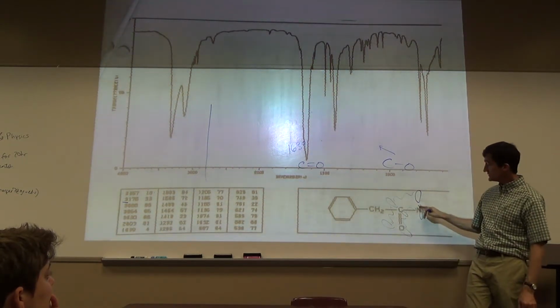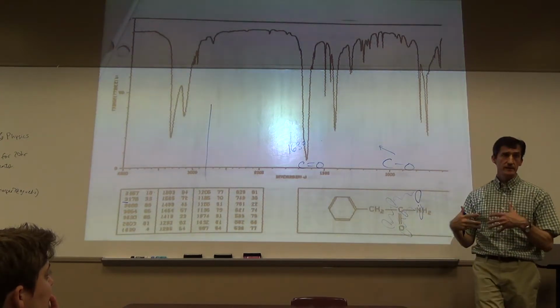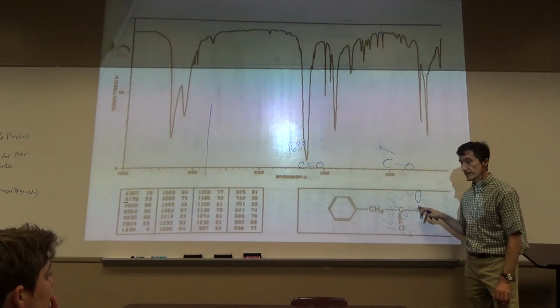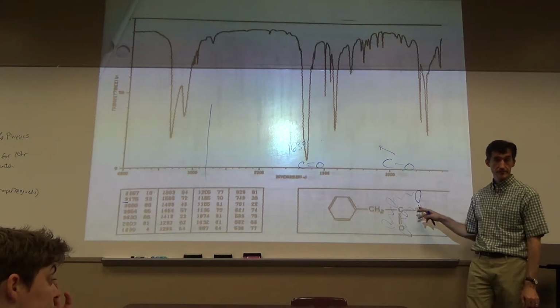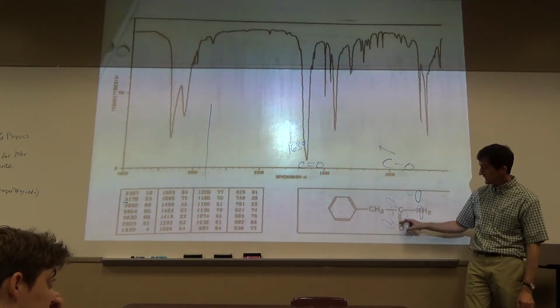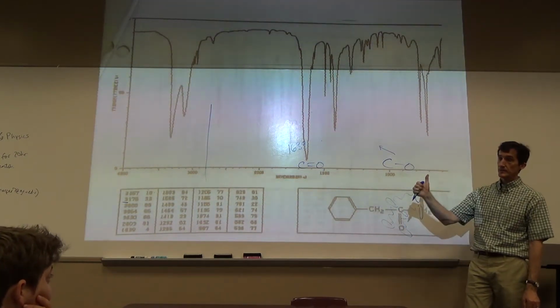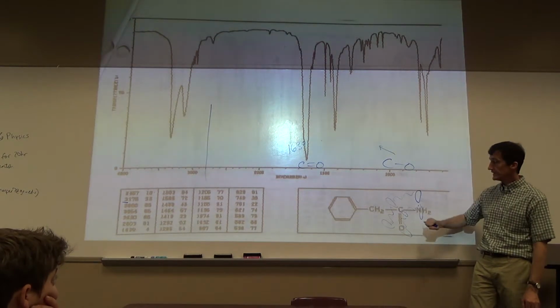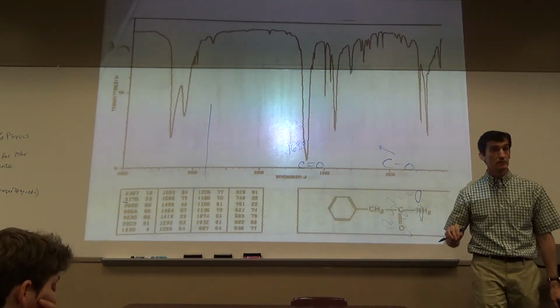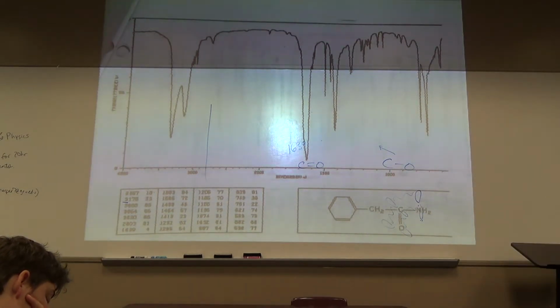Now, if that's an oxygen, it would also be conjugated. But see, oxygen is more greedy. It doesn't like to share its electrons. Nitrogen is a good sharer. And it's pumping electrons into this, and it's actually weakening that bond. When you weaken the bond, you move this way. Take-home message, amides have low carbonyl. Okay, we can discuss more why.